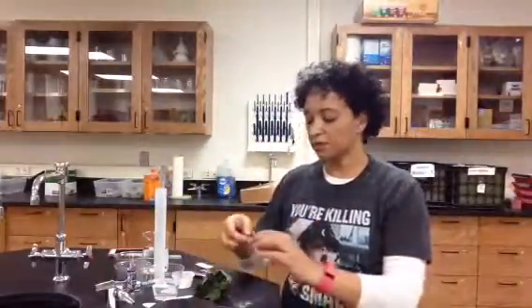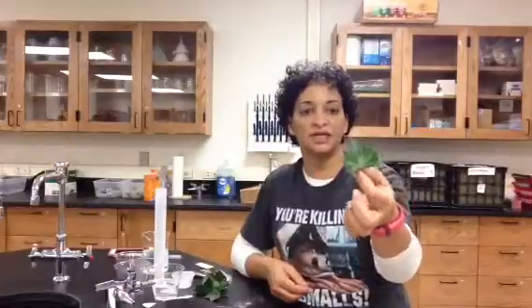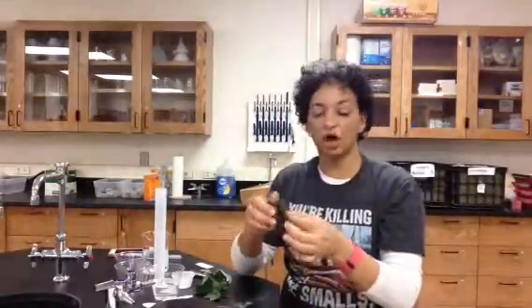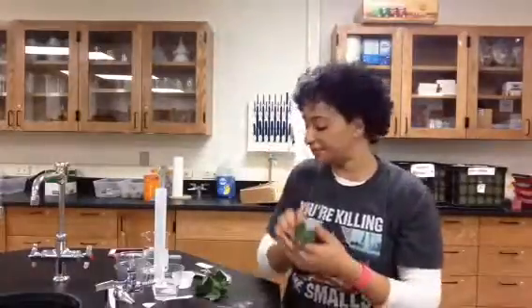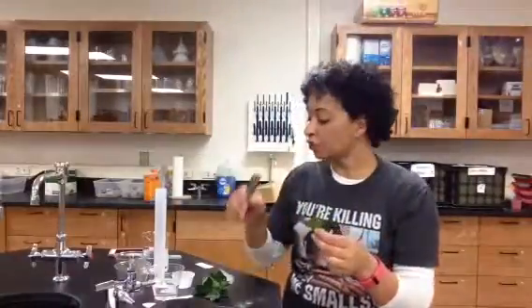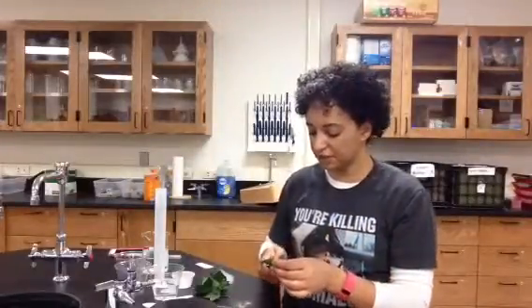All right, so today we're going to be testing photosynthesis in a type of leaf called English ivy. The nice thing about this leaf is it's pretty hardy, and you can find it even in the wintertime. So I'm going to take my handy dandy hole puncher, and I'm going to punch out 10 leaf chads for each cup, for a total of 30 leaf chads. So let me go ahead and punch some leaf chads out here.